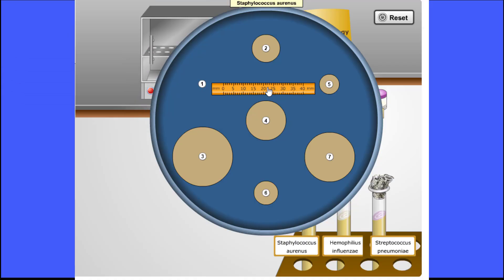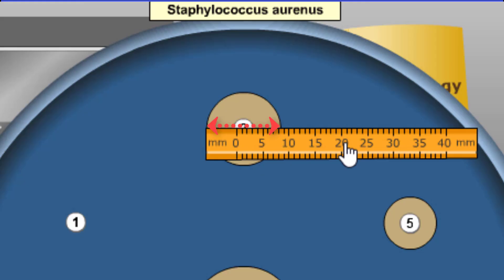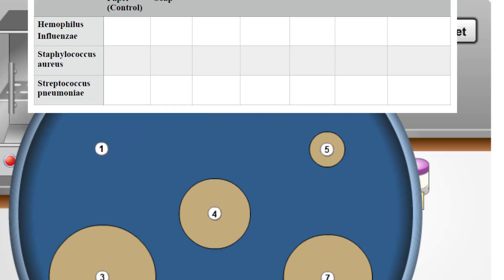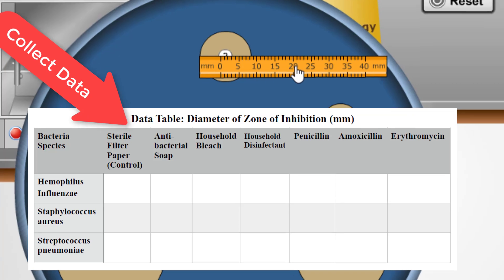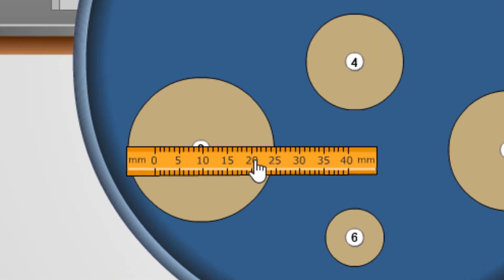For number 2, in order to measure the zone of inhibition, we will want to take the measurement that is the diameter of the circle of the zone of inhibition. Be sure to write down and record in your laboratory table the zone of inhibition for each type of bacteria and disinfectant or antimicrobial agent.